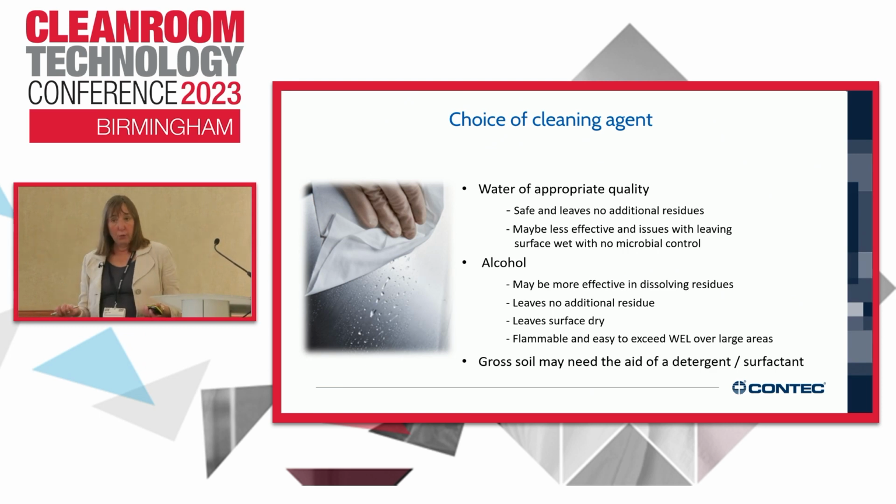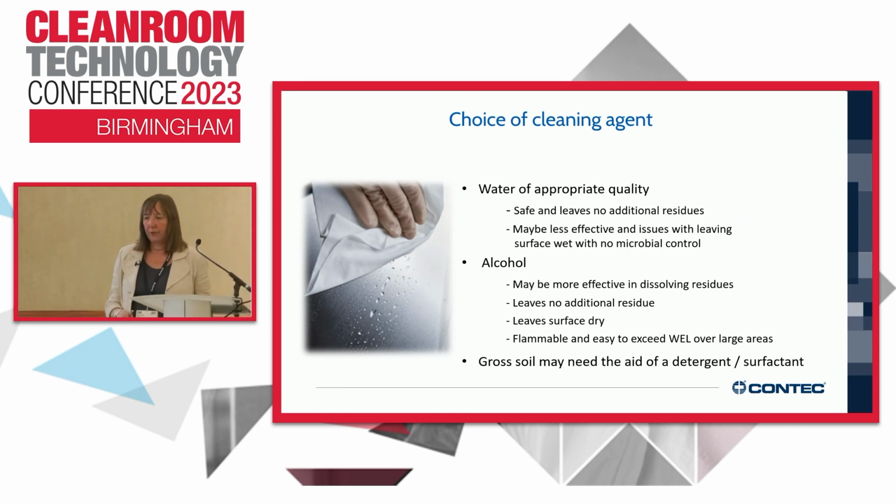You can use water for injection if it's a high-grade clean room or appropriate quality water. Alcohol may be more appropriate for certain types of residues. And of course, if you've got proper dirt, you will need a detergent.